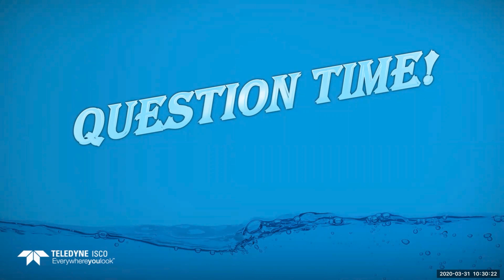That's probably something that I would want to call our tech support guys with. They could probably help you out with more specific application type questions. But definitely you want to try to keep that as dry as you can. Have some type of shade over the top of that so it doesn't get rain or splashing water. You definitely want to make sure it's the water rising that's hitting the sensor. So.